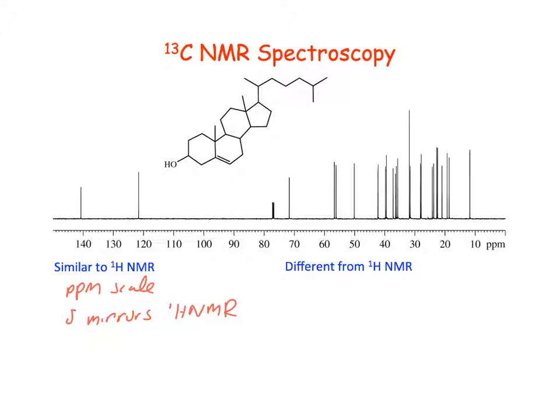What about the chemical shift range compared to proton NMR? Yeah, we have a much larger chemical shift range. Would we see negative values, though? I think only for unusual things would be negative, right? In carbon NMR. Yeah, and in proton, right?